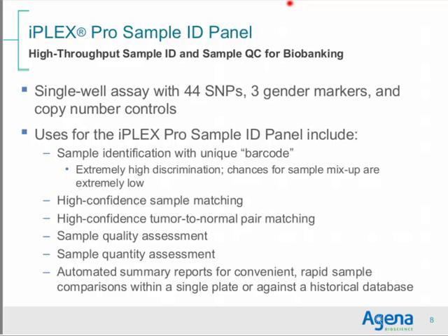Now, we don't really need 10 to the minus 18, although it's useful to have for sample-to-sample matching. But as Dr. Zmuda pointed out before, when you're trying to do tumour to normal pair matching, there is a challenge that occurs. In tumours, we have loss of heterozygosity and copy number gain. So any genotype, any marker that is a heterozygous genotype in the germline could be any genotype in the tumour. That is, if you're GA in the germline, you could have lost the G and become homozygous A in the tumour. You could have lost the A and be homozygous G, or you could be heterozygous.